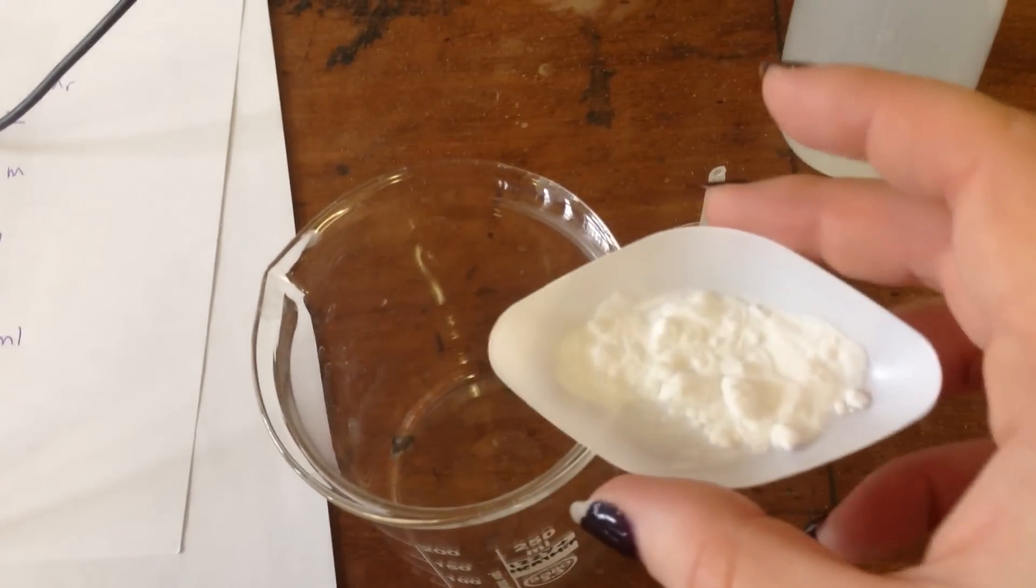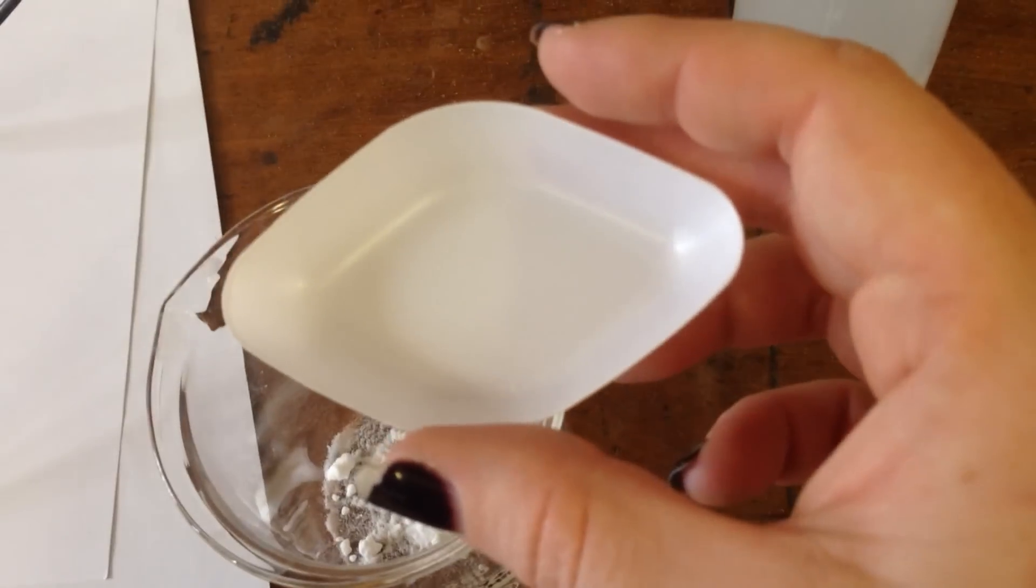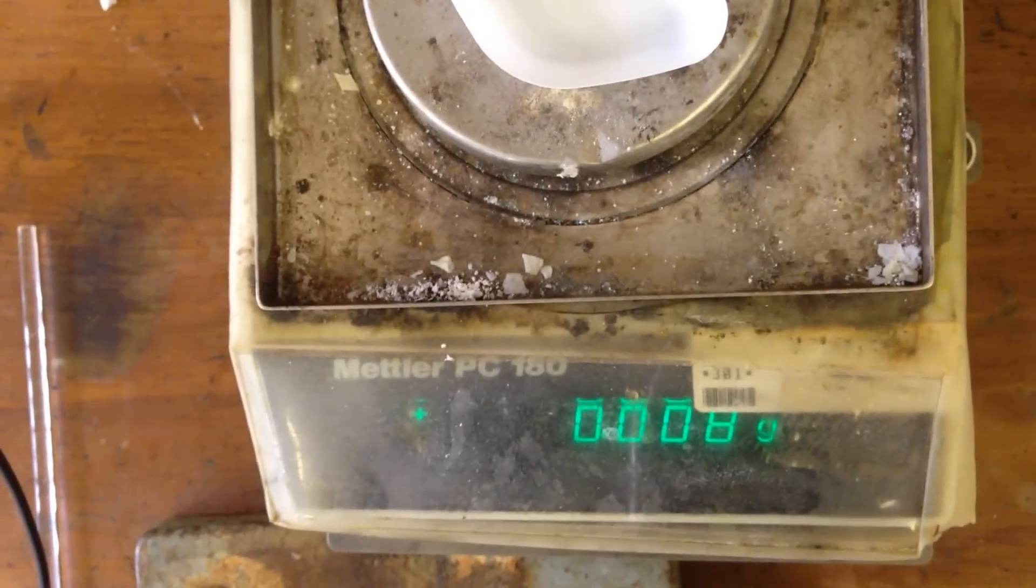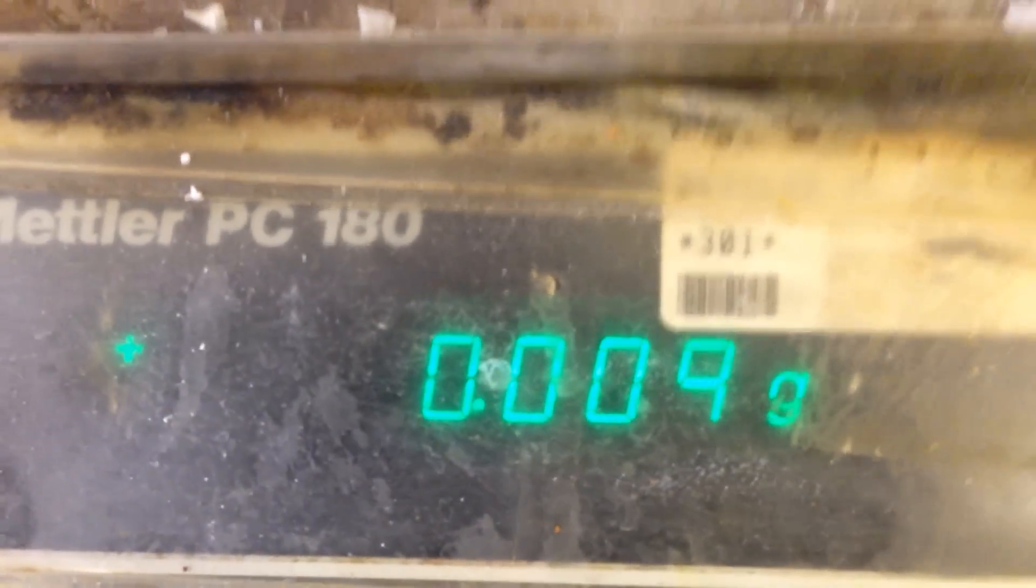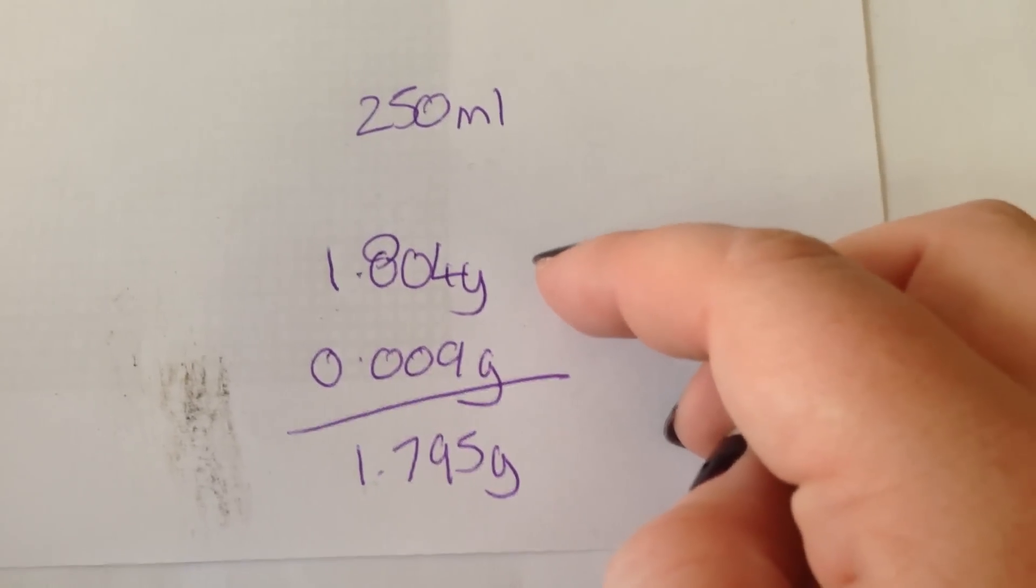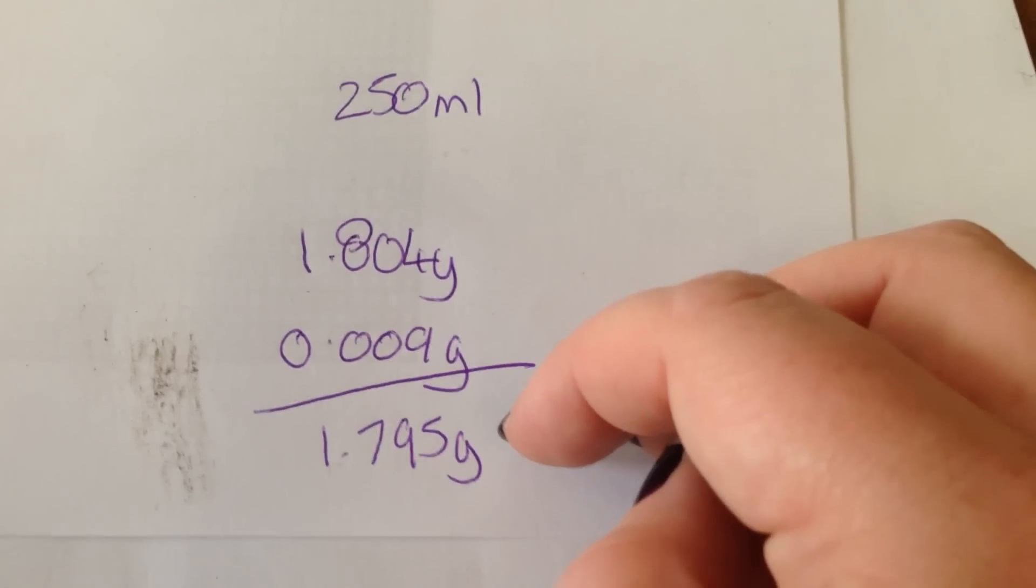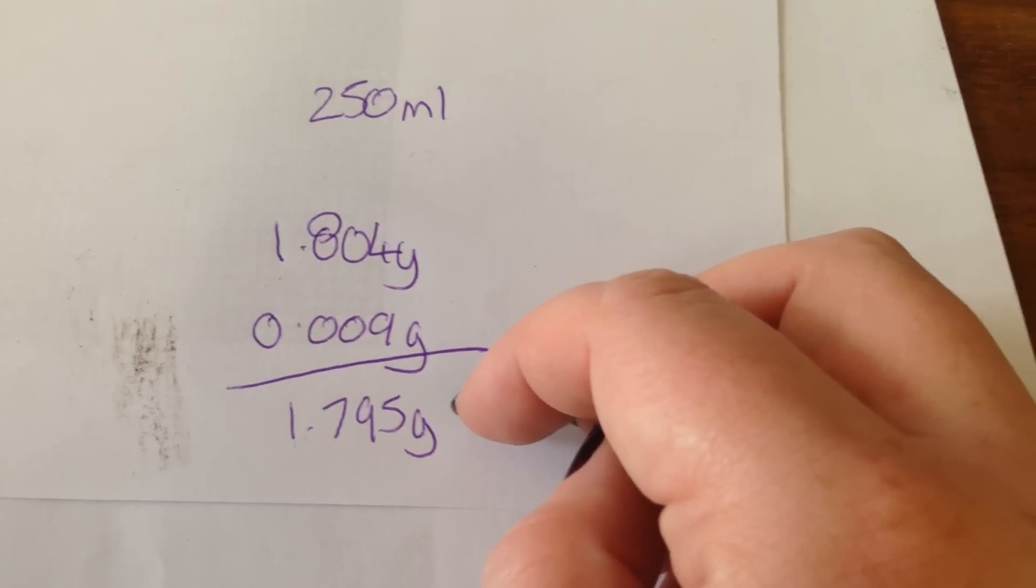I've recorded the amount that the sodium hydrogen carbonate weighed in the weigh boat so I'm just going to tip all of that in there. And the weigh boat isn't going to be exactly empty so what I need to do is pop this back on the scales and then I need to see what the scales read and they read 0.009. If you can't see that very clearly, it's 0.009 and I need to record that number for later. So we can see here I have my mass of my sodium hydrogen carbonate in the weigh boat before, the mass of the weigh boat after, take the two of those away together and we get the actual mass of sodium hydrogen carbonate transferred to the beaker. That's 1.795 grams.